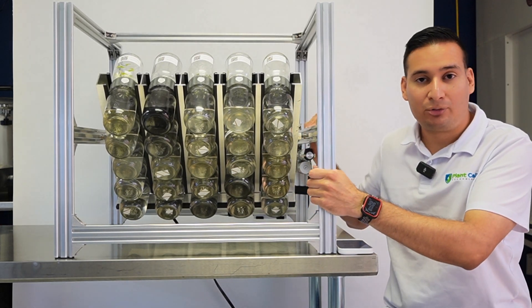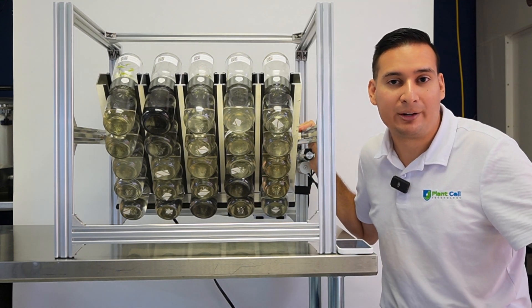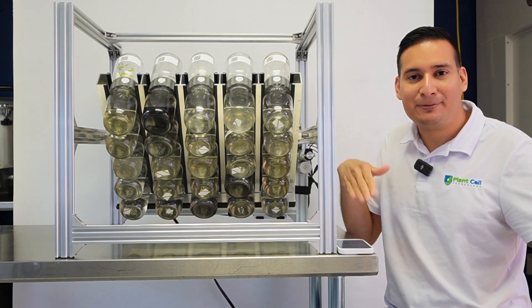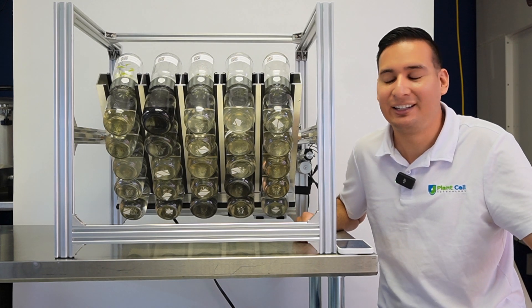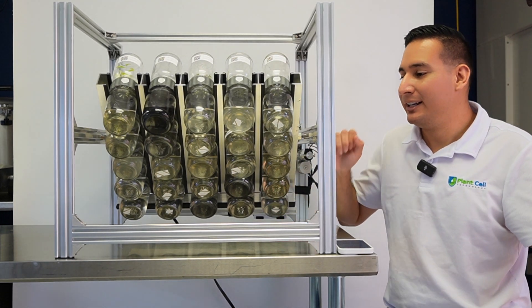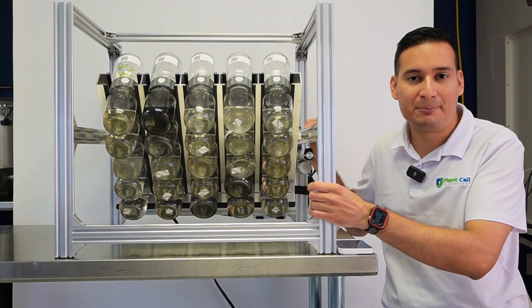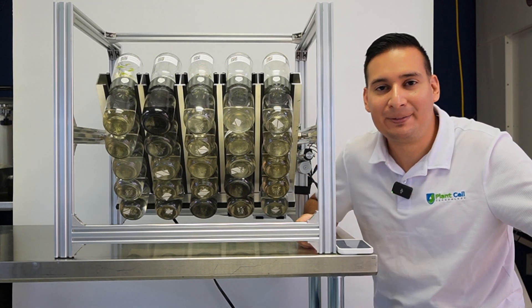This is a system that we love. It is very strong — it's made of aluminum, which is super strong. We have tested it for the equivalent of over 10,000 hours, just flipping it back and forth for many months, and it has been super reliable. It is very heavy duty, but also very light, so shipping is very affordable.